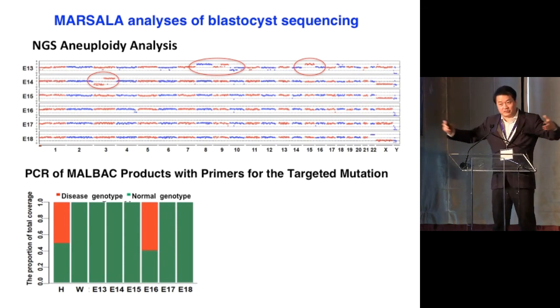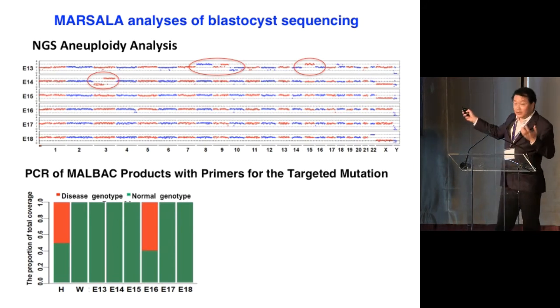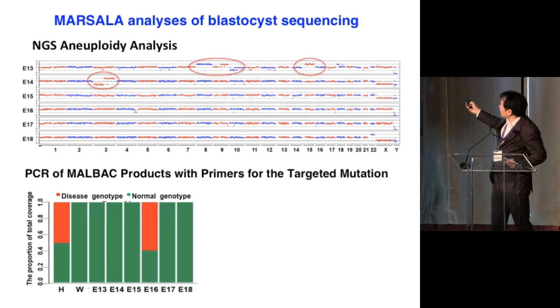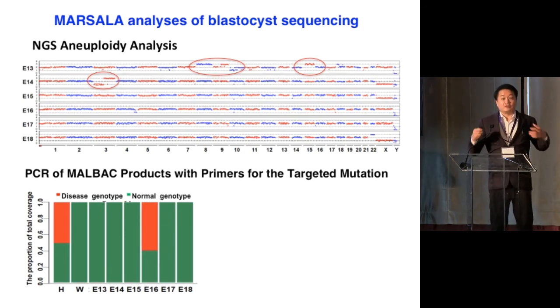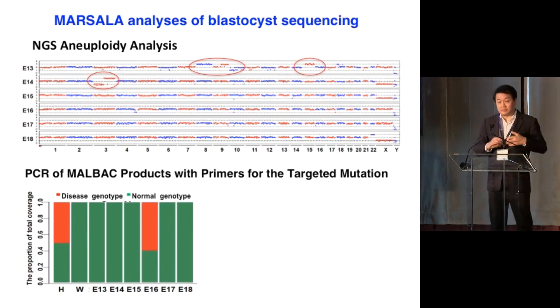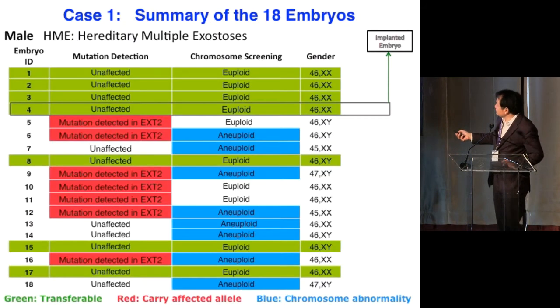It has to be adjacent because you could have a recombination, okay? But there are enough points, and they're consistent. So if, let's say, at one particular position, say here, for some reason you couldn't detect it or you detected wrong, you will be able to double check, and with 10 of them, you would basically just eliminate the false positives.